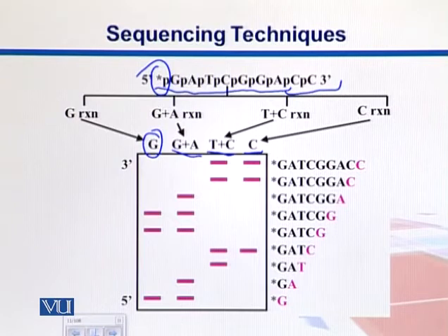Here in the gel we see two bands down there, and the band is present in both of them. So from this band we conclude that it's a purine, and then within that we are clear that it's guanine. If there is no band in the G only reaction, then for sure it's adenine. So here for instance we see there is just one band in G plus A but no band in G.